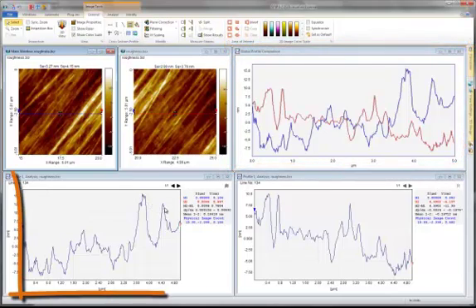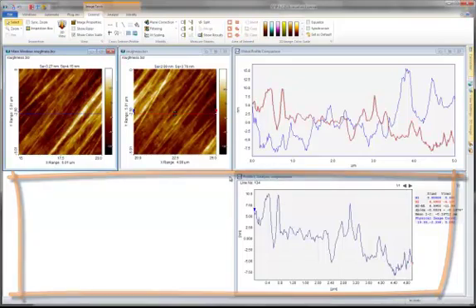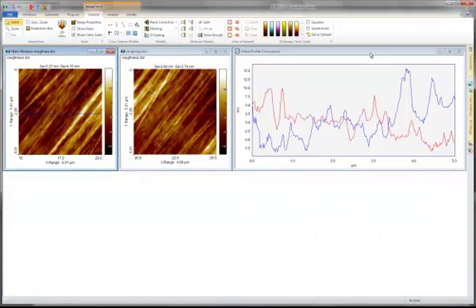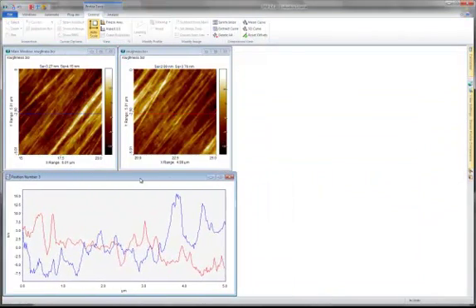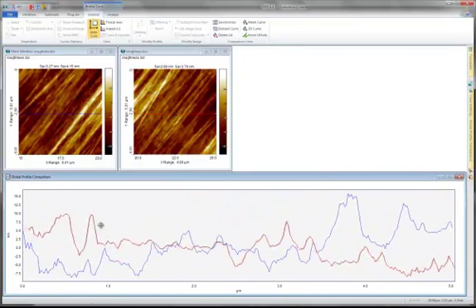We will not be needing these views anymore so we can go ahead and close them. Now we can simply move the profiles using the mouse.